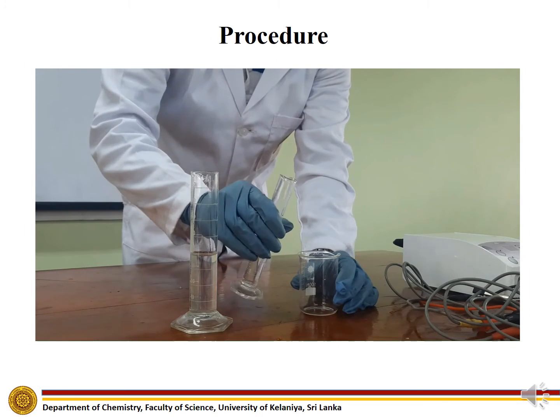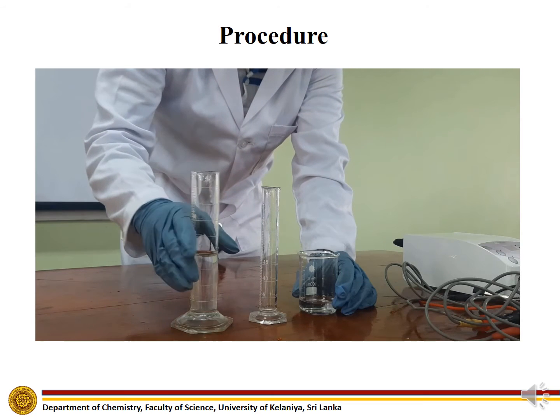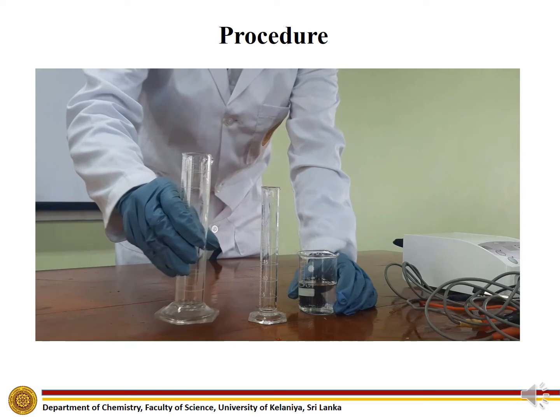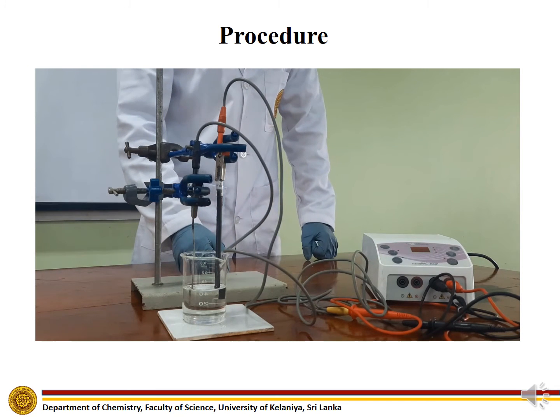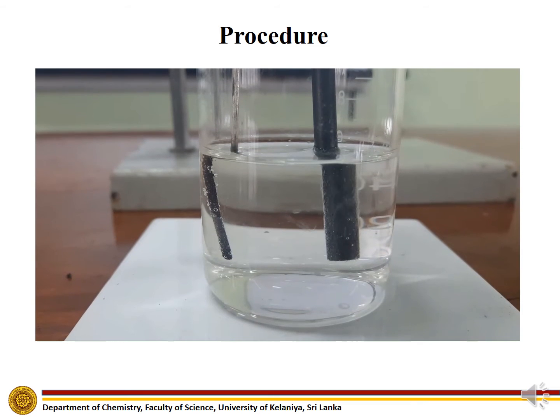To a 100 milliliter beaker, add 20 milliliters of potassium chloride solution and 40 milliliters of deionized water to prepare a dilute potassium chloride solution. Connect the positive terminal of the variable DC voltage supply to the silver wire and connect the negative terminal to the graphite electrode as shown. Leave the setup connected to the power supply for a few minutes.